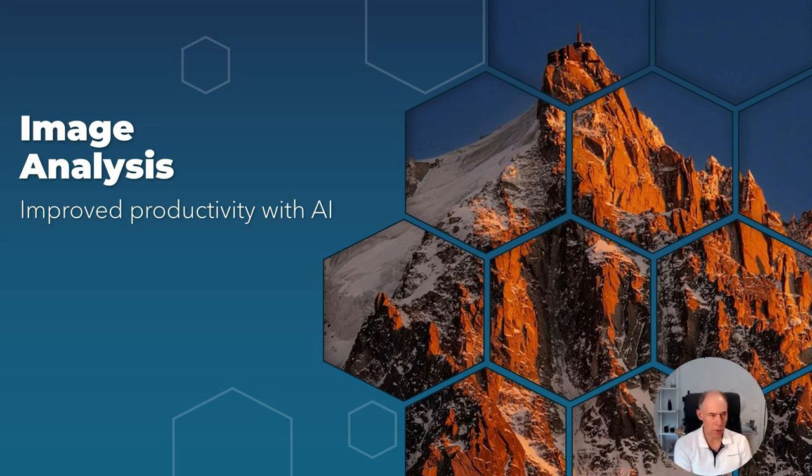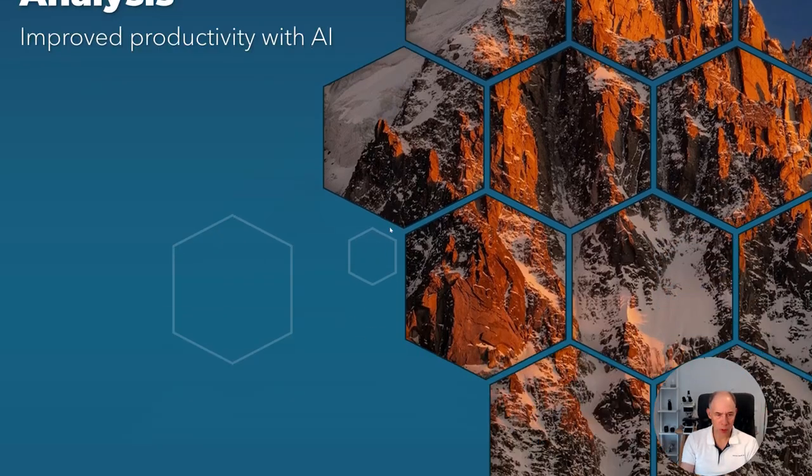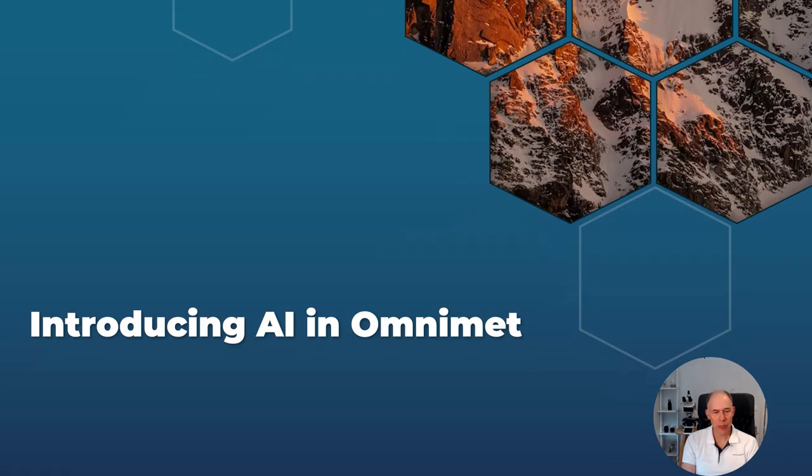Hello, in today's video I'm going to talk about image analysis and more specifically how AI can be used to improve productivity. So I'm going to talk about AI in combination with Omnimet.